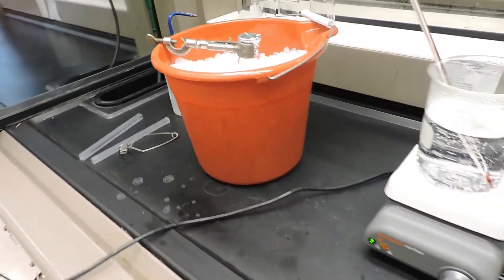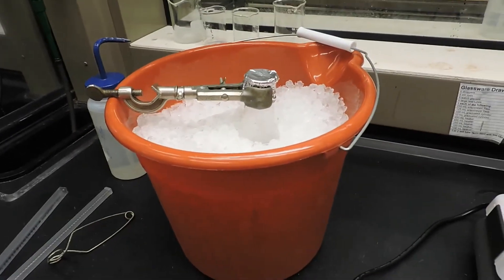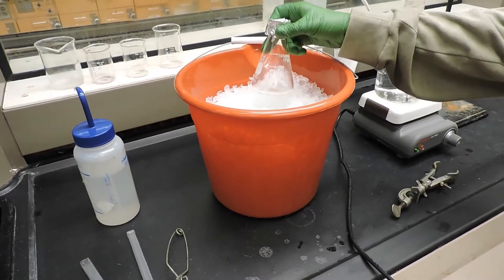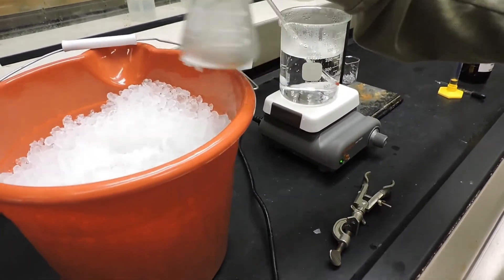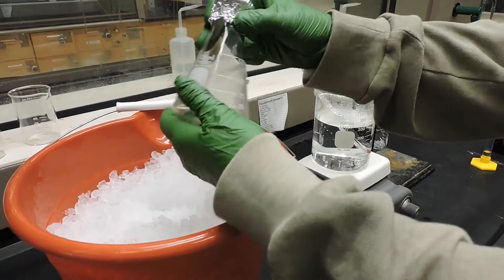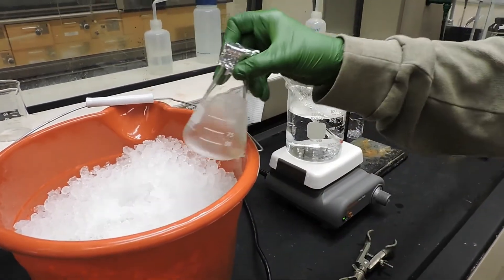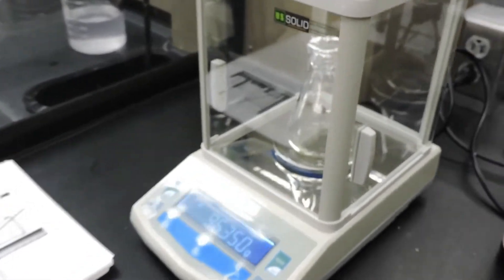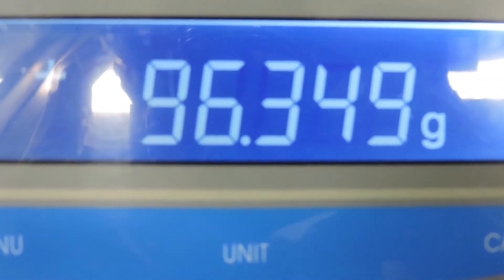Once the vapors have recondensed, we will dry the flask off and then find its mass again. Now that the flask has been sitting on ice for a little bit, the vapors inside have recondensed. We'll dry it off and find its mass. The final mass is 96.349 grams.